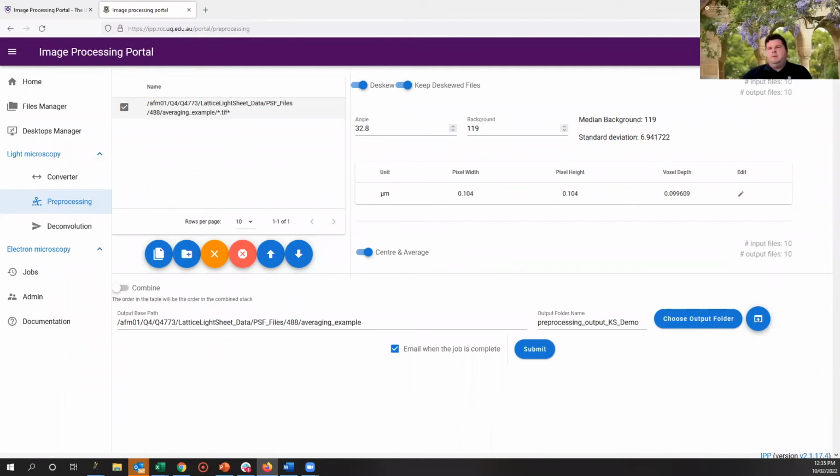Yeah, so Niall at WEHI runs the Lattice Light-sheet that they have. They have a home-built system. We have the 3i commercial system, which is pretty much the same instrument. And then there is now also the full commercial Zeiss white box instrument. Capturing the data on the Lattice is not like a normal microscope. There's no eyepieces, so it can be difficult to know if the data is good. And if you are going to be generating a terabyte, you want to know that it is useful. So completely agree with that and Niall's sentiment.